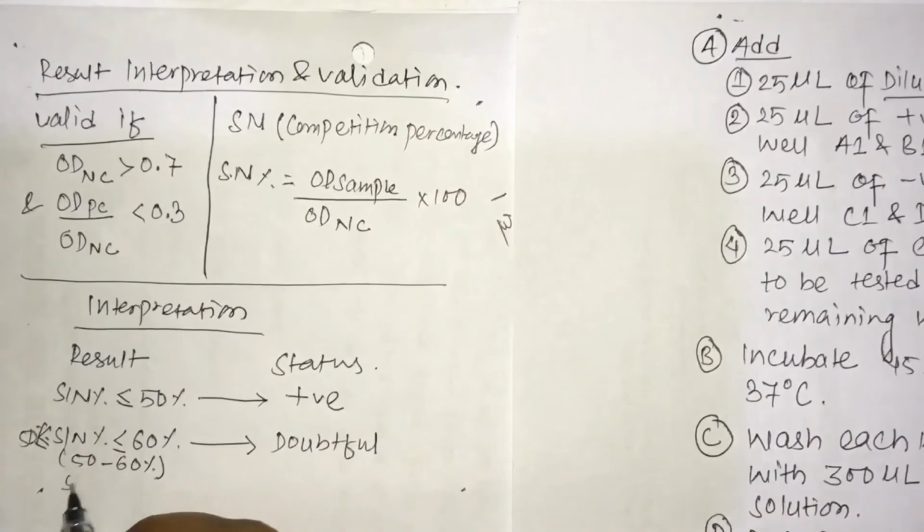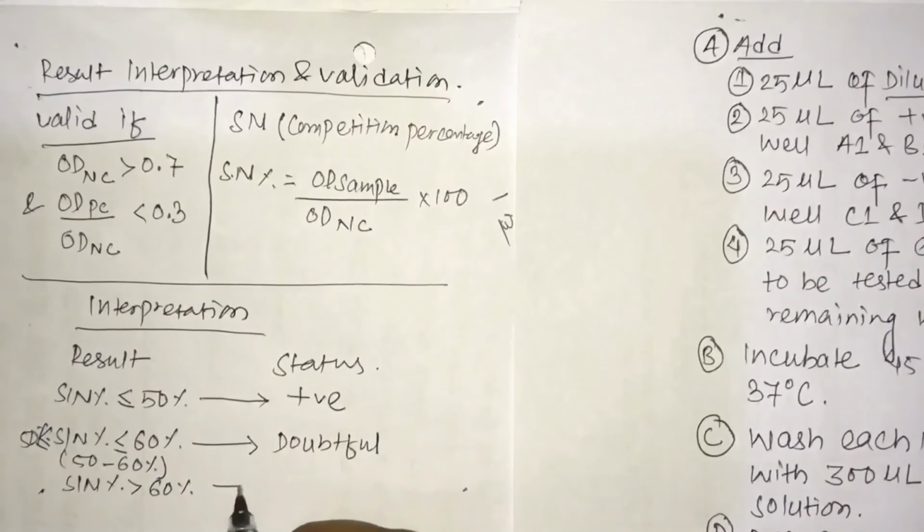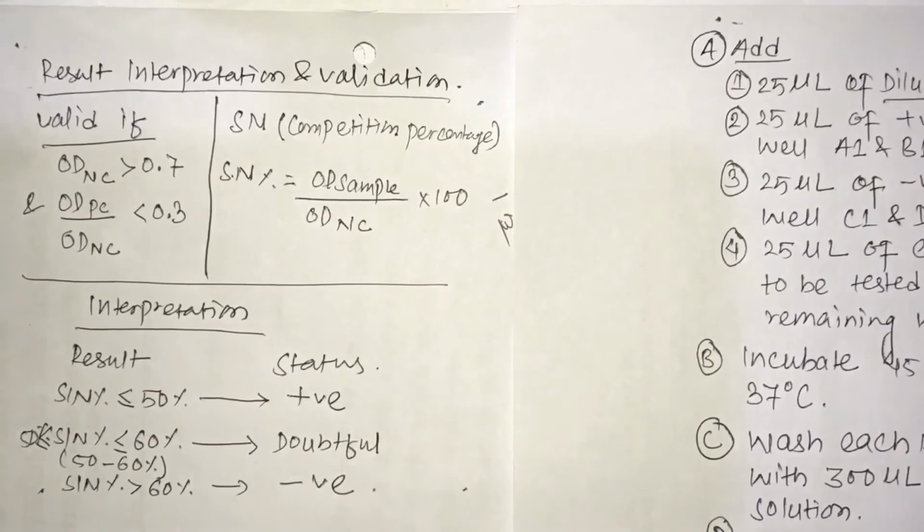The SN value is calculated from the optical density that we get from the spectrophotometer or the optical density measuring equipment that we used previously. So this is how ELISA is done.